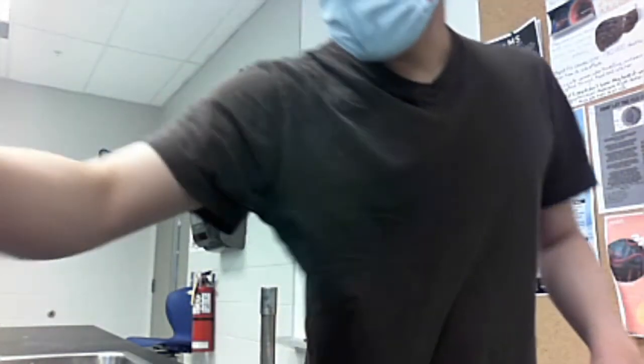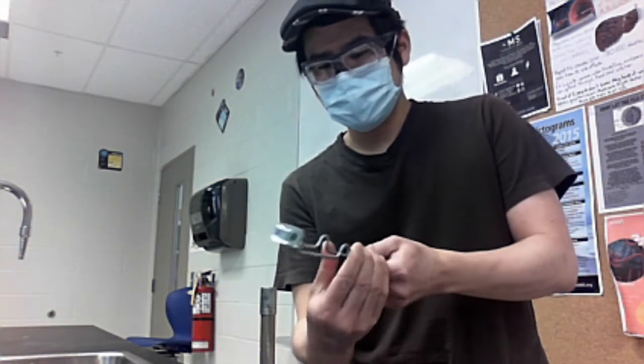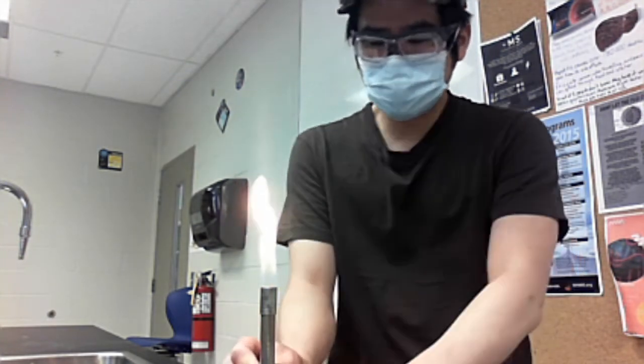So let's turn on the Bunsen burner. First off, turn everything clockwise — the barrel as well as the adjustment knob. Turn on the master valve, open this up, and you'll hear that sound. And there you go. However, this fire is not hot enough for the experiment.